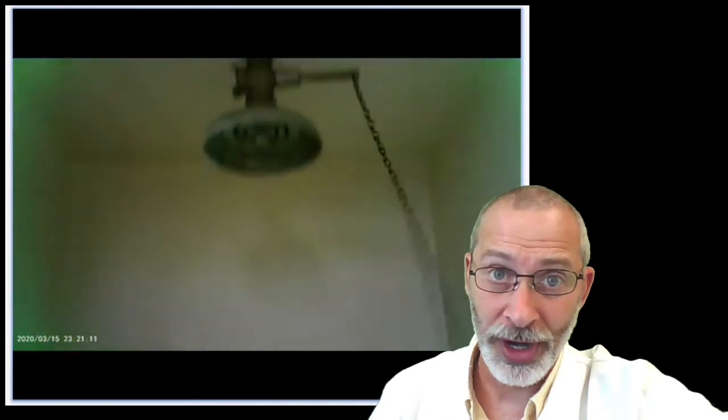If you were to be doused with a chemical, or you're in the front of the lab near the emergency shower and you're on flames, you can certainly go into the emergency shower, which looks like this. It's labeled emergency shower. For your privacy, we have a shower curtain, which, by the way, will always be open on lab days in case you need to go in quickly. And there's a chain hooked up to a big old loop at the bottom. You go in there, you pull that chain, and you will get lots and lots of water pouring on you very, very quickly. Yes, it is cold.